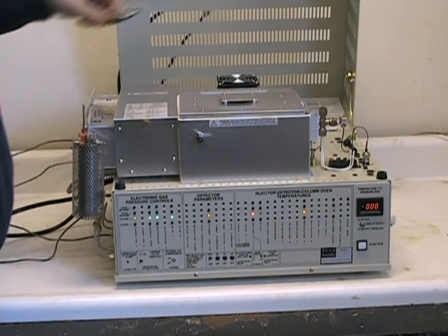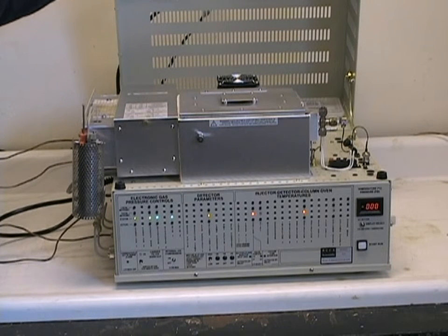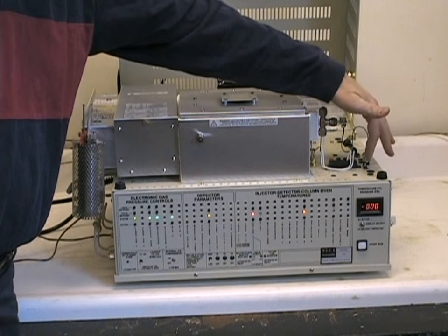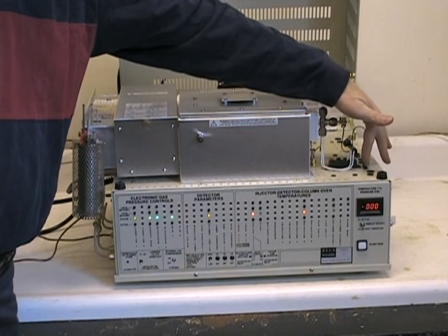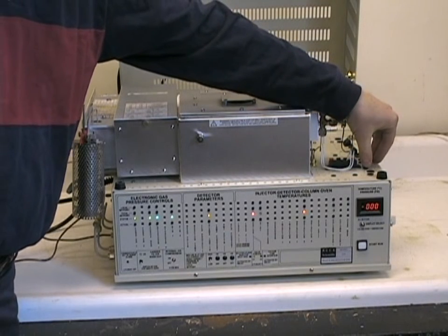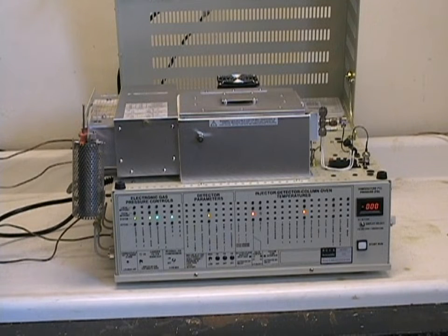With all of our temperatures set, we can now toggle the FID gain switch for the detector to either low or high, depending upon the sensitivity requirements. It is recommended to start with a gain of low initially, since this will give you minimal noise and drift, and raise it to high as needed.